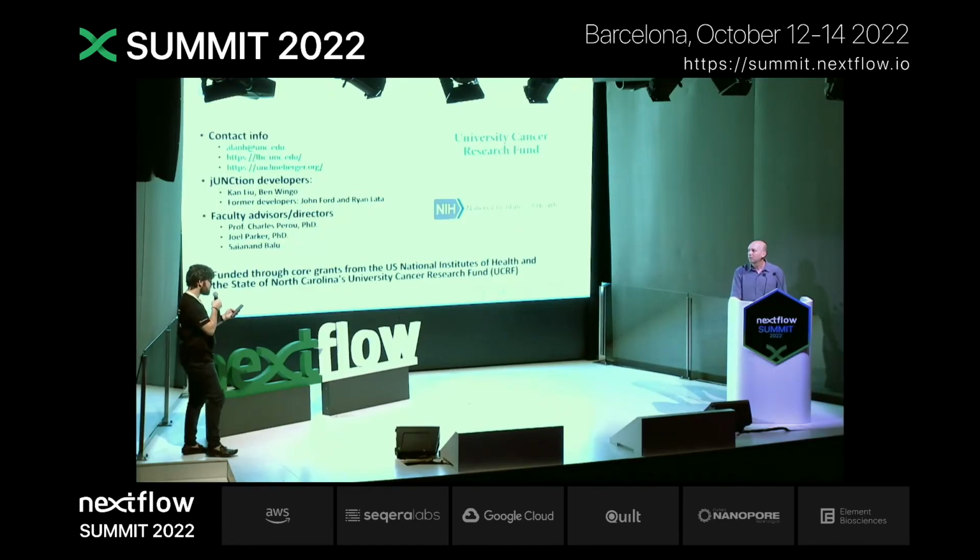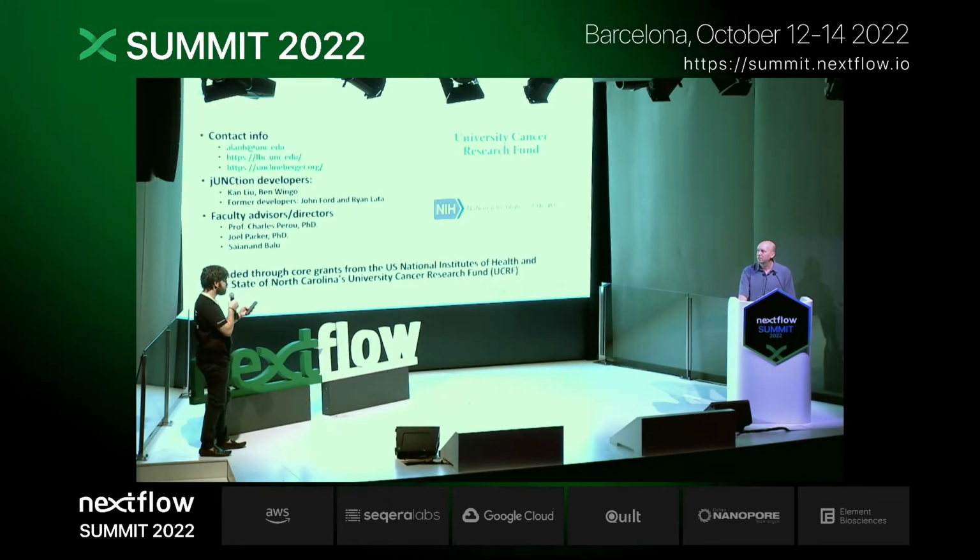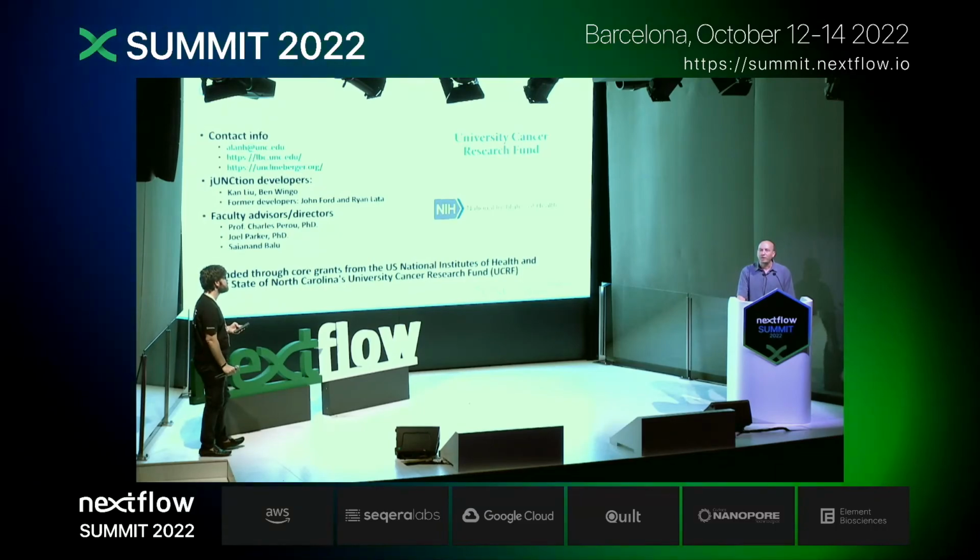So one last question from Evan. So what do you use for LIMS? Our LIMS is a custom developed thing by our local group. It's more than a decade old, and they have a whole team doing development on it, and that's a Java app, and that is currently being ported over to a JavaScript app native.